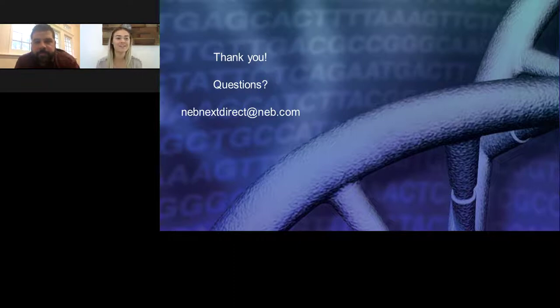We have time for one more question, and this one says, what are the common sources of error in target enrichment data? It can come from different places. We talked about some of the errors that can be incurred during sample processing itself, through fixation or extraction processes where the DNA is potentially treated with harsh chemicals that can induce some base pair changes, as well as impact the backbone itself. PCR amplification is another source of error: as you make copies, it's not always perfect, so you incur some level of errors there. Also, in many hybridization-based enrichments, the washes to remove off-target molecules use relatively harsh chemicals that can also induce base changes and cause error in your sequencing data. And then finally, the sequencers themselves.